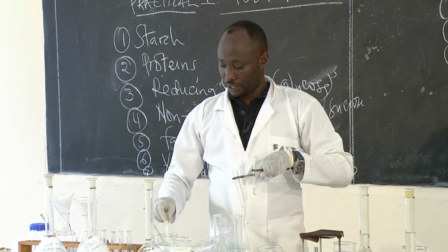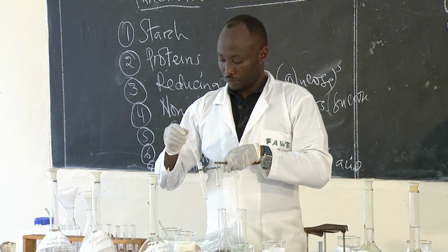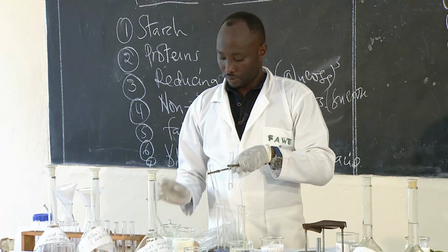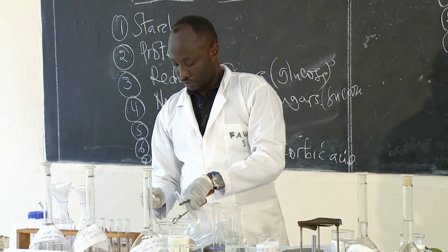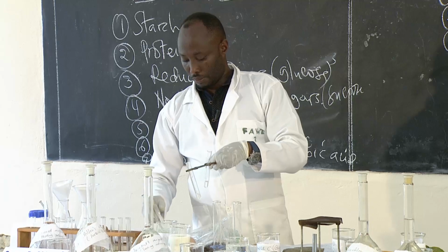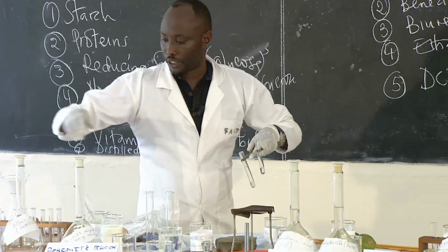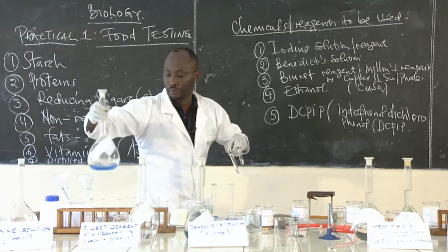Now let us see if it contains proteins. The same amount. I'm going to use a solution here, the Biuret test. The Biuret test. Good.